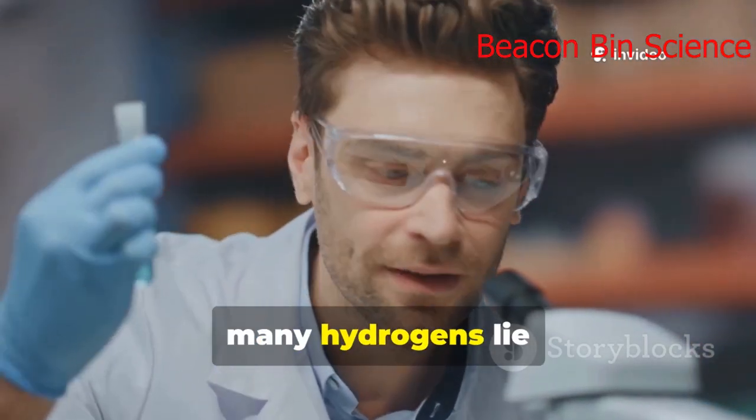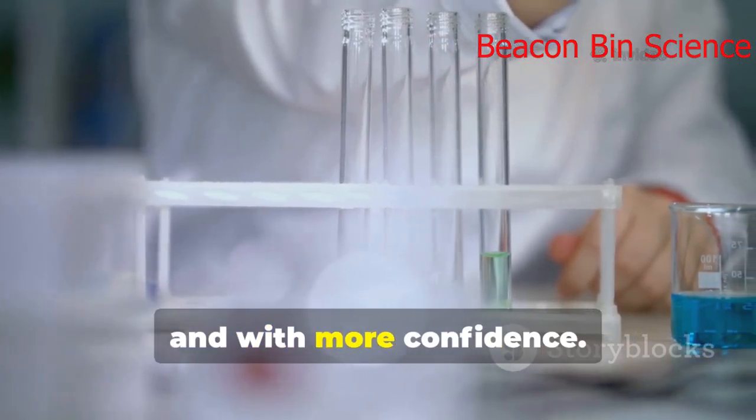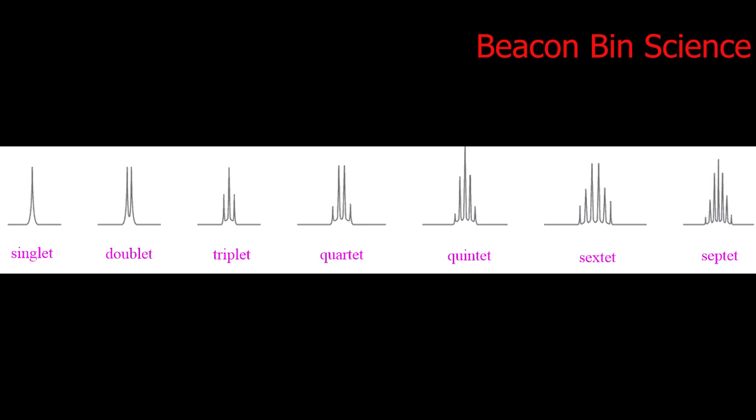In a nutshell, integration is your NMR cheat code. It removes guesswork for how many hydrogens lie behind each peak, so you can solve structures faster and with more confidence. Now comes the fun part, splitting patterns.